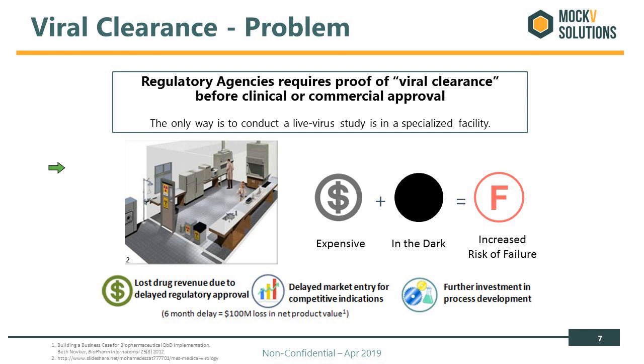The reasons for this are fairly obvious. It's because viral clearance requires the propagation and quantification of live mammalian viruses. The environmental and logistical challenges require specialized labs and personnel, and because of this, most companies outsource viral clearance studies to contract research organizations. Because of the complexities involved in propagating virus, these studies are often pretty expensive. And these high costs unfortunately present a major hurdle to data accumulation during the early years of process development and characterization.